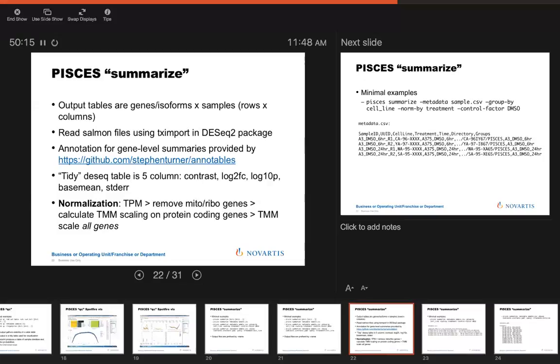So effectively what you're saying is, okay, I have this GENCODE annotation. Let's throw out all the 40,000 things that we didn't care about. Pretend like we ran our quantification pipeline using only 20,000 genes to get TPM. Then let's scale that appropriately. And then all of this other stuff that we've effectively removed, let's also scale that too. Why? That's the final step. I don't know that it's appropriate. I haven't had any experiments that hinge on the success of a differential analysis of the non-coding portion of the transcriptome. Why go back to them if you exclude them, if you don't want to look at them?